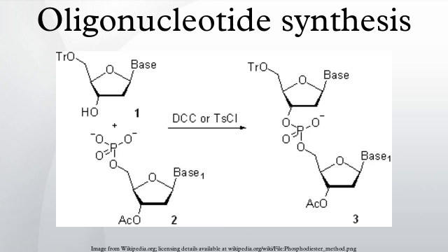The N-acyl base protection and the 2-cyanoethyl phosphate protection may be, and often are, removed simultaneously by treatment with inorganic bases or amines. However, the applicability of this method is limited by the fact that the cleavage of 2-cyanoethyl phosphate protection gives rise to acrylonitrile as a side product. Under the strong basic conditions required for the removal of N-acyl protection, acrylonitrile is capable of alkylation of nucleic bases, primarily at the N3 position of thymine and uracil residues, to give the respective N3-(2-cyanoethyl) adducts via Michael reaction.